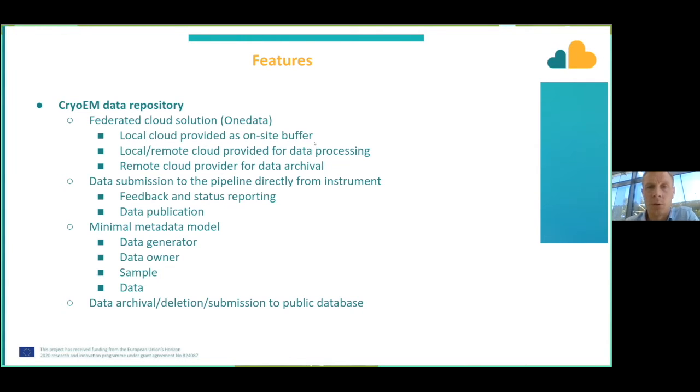So one storage that we have in the facility is working as a local temporary cloud provider. But we have also tested a remote cloud provider that can be used not only for the temporary data storage, but also for the data processing. And then the remote cloud provider for the data archival.